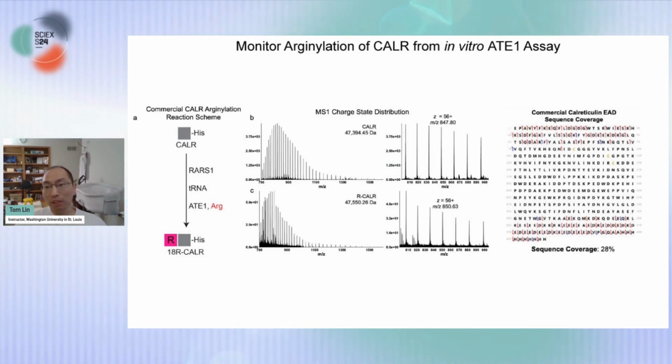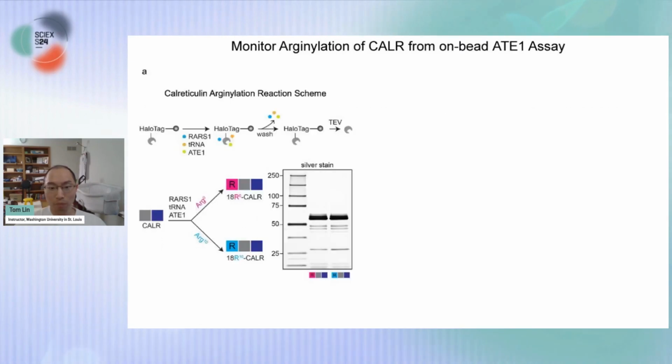Moving forward from the endogenous arginylation, we also applied our platform to the in vitro arginylation system, similar to our bottom-up workflow. Using a commercial calreticulin and ATE1 assay, we can arginylate the calreticulin and monitor the arginylated product using the top-down proteomics workflow here.